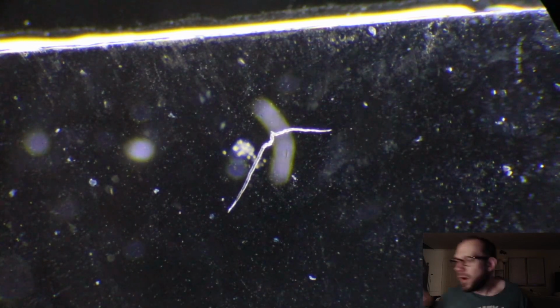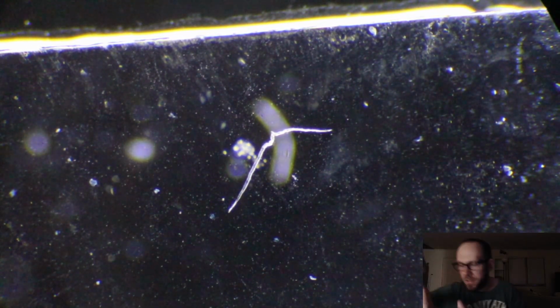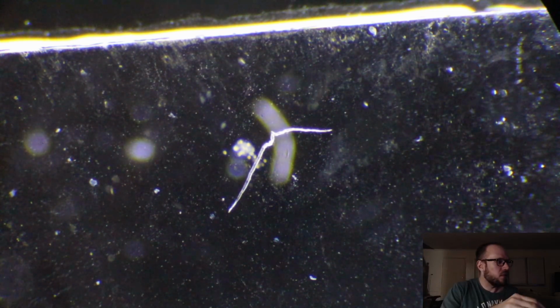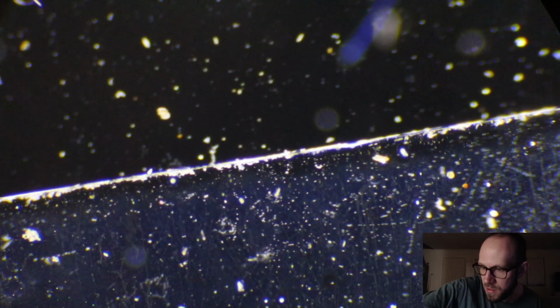Damn. Alright, well, I'll show y'all one more slide. It's so covered in dust. Dust sucks. Okay, there's nothing live on this slide. But there is something on it that might be of interest, apart from all of the dust. I really need to find a way to store these.